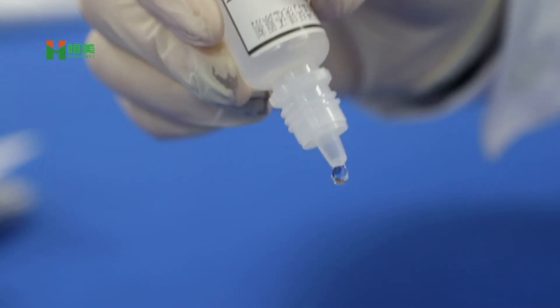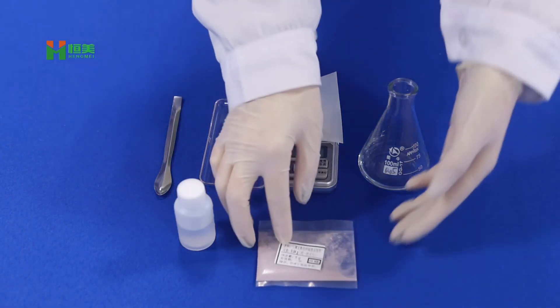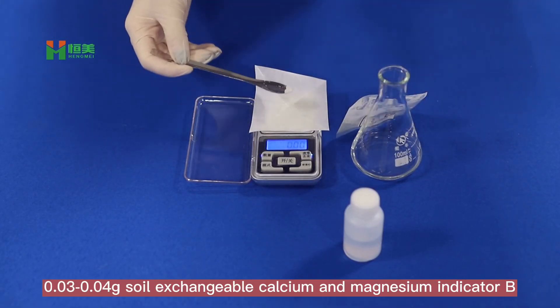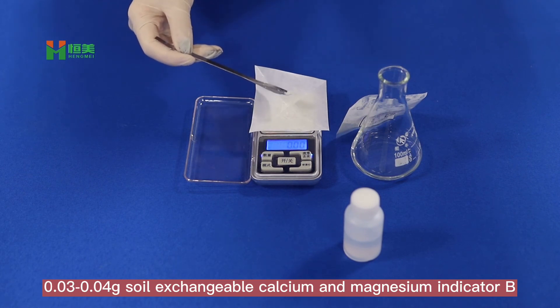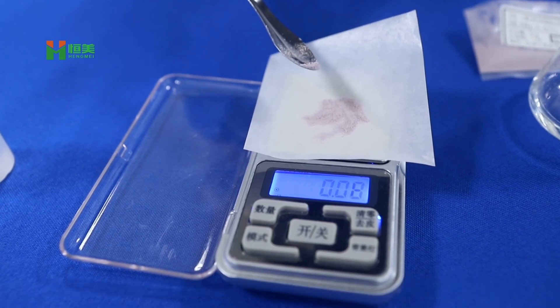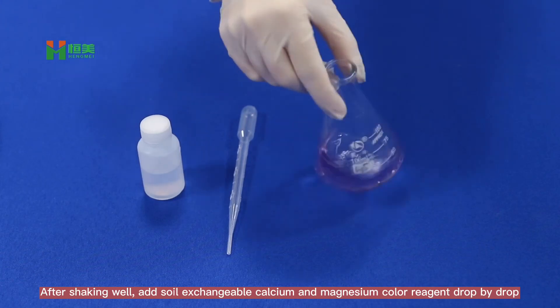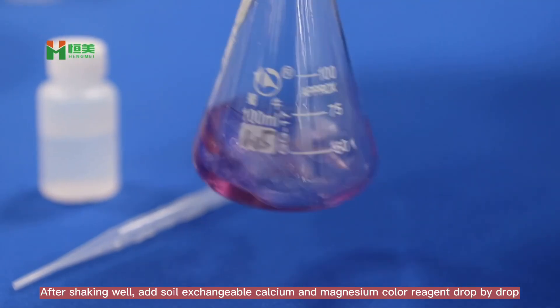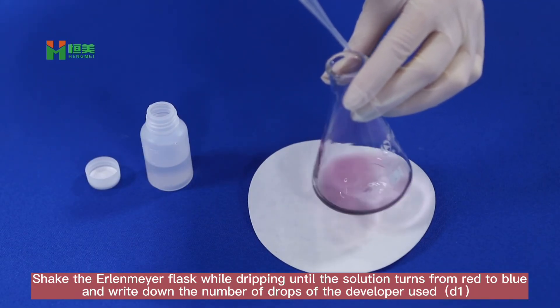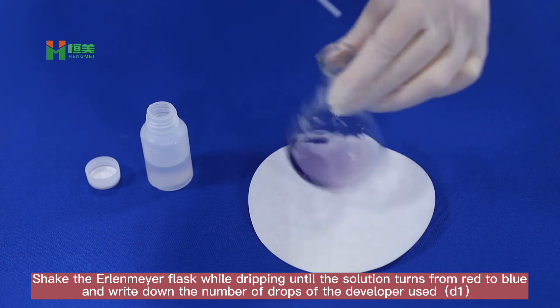Add 4 drops of solid-exchangeable calcium and magnesium producing agent and the corresponding soil exchangeable calcium and magnesium reagent. After shaking well, add soil exchangeable calcium and magnesium colorimetric agent drop by drop. Shake the Erlenmeyer flask while dripping until the solution turns from red to blue, then write down the number of drops of the developer used.